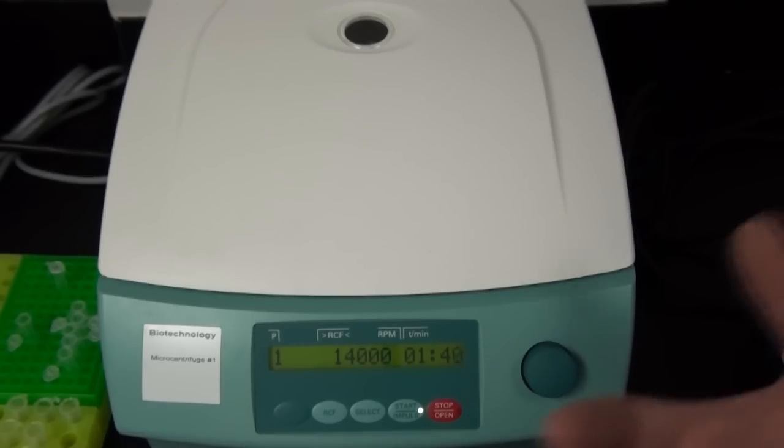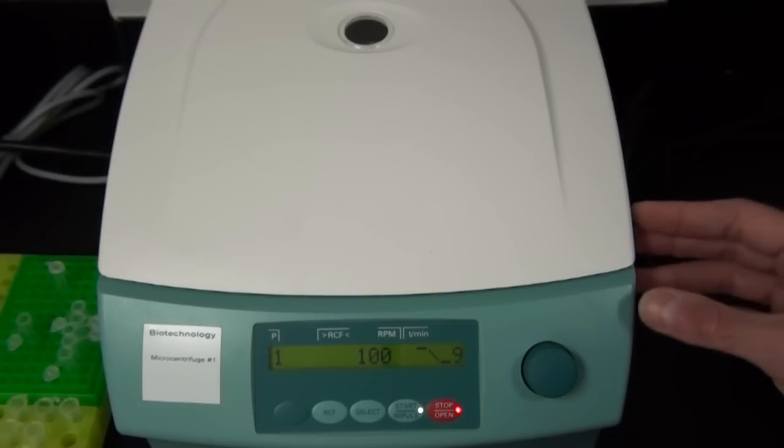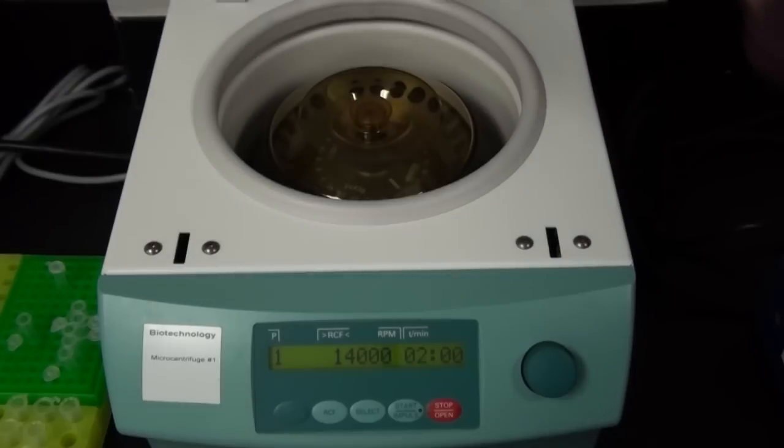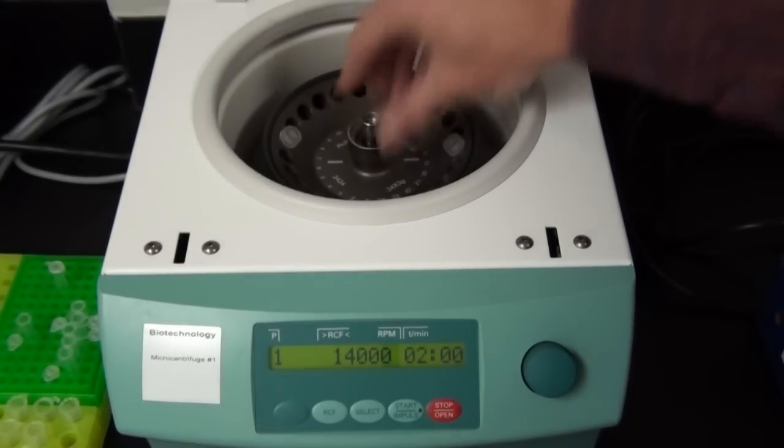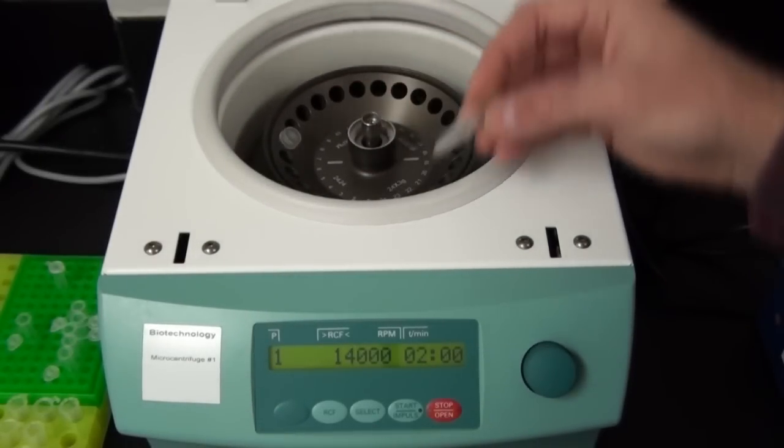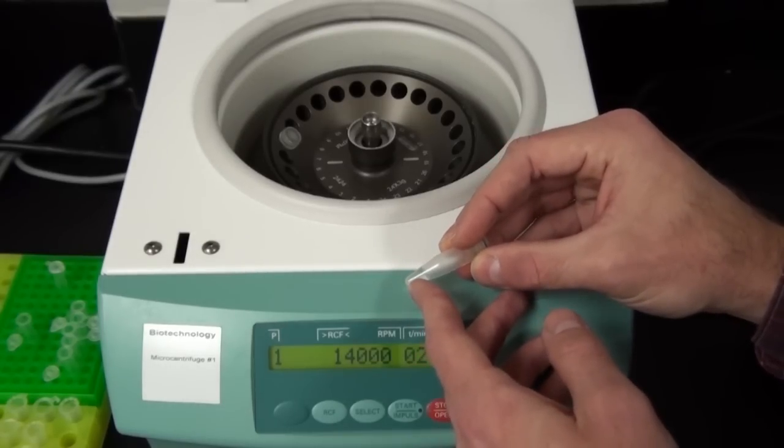After two minutes, it will stop automatically. I'm going to stop a little prematurely here. It will then slow down. On this particular instrument, when it reaches zero, the lid will pop open. Then I can remove my samples. Be careful, you don't want to disturb it. But then you will have your stuff at the bottom of the tube or what we call a pellet.